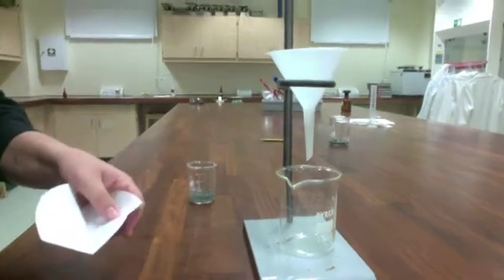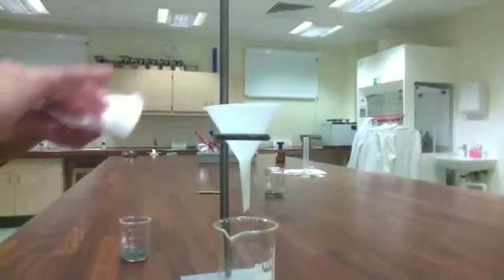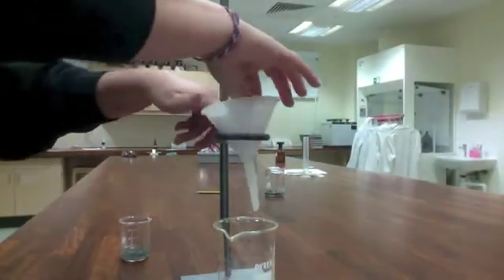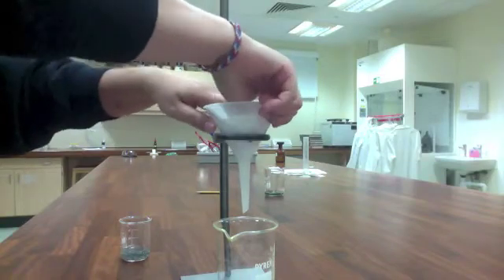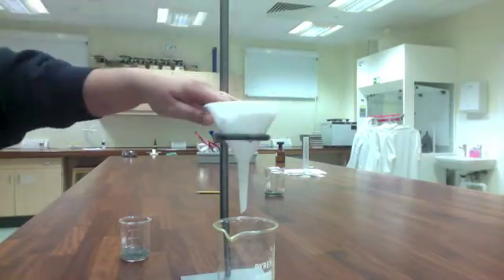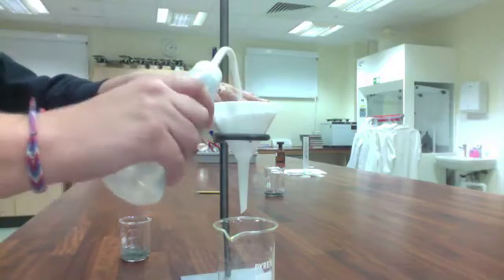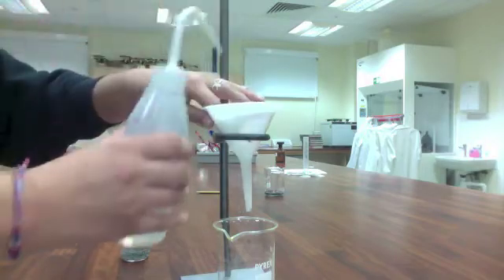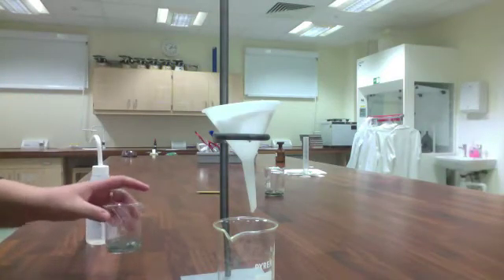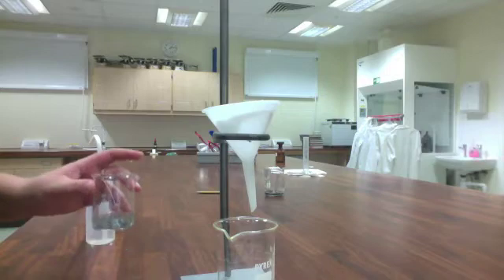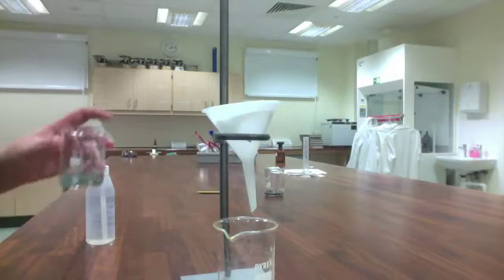What you want to do after that is put the filter paper into the funnel, and we want to make sure that it sticks down before I pour my solution from my beaker into it. And to do that, just take some distilled water and wet the edges there so that your filter paper stays attached to the sides of the funnel. As you can see, we've got some water coming through at the end.